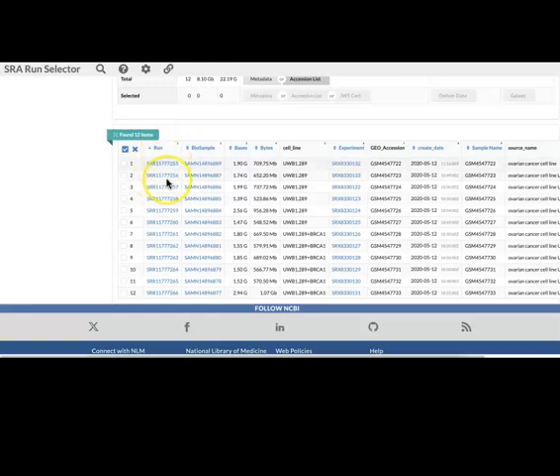So here are the SRR run study. As mentioned in the previous slide, each sample SRX experiment has an associated SRR run as well as the SRA. When we download this later on, we will see that each SRA is going to have two sets of reads associated with it, _1 and _2. One of these will be the forward and one will be the reverse strand.